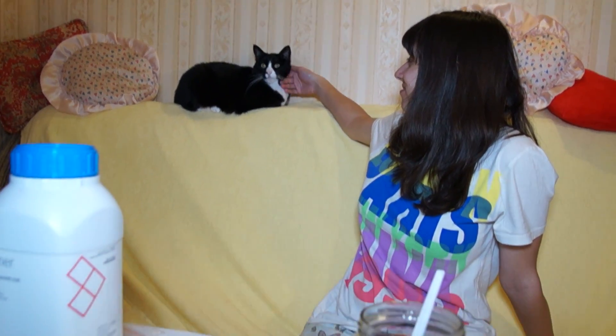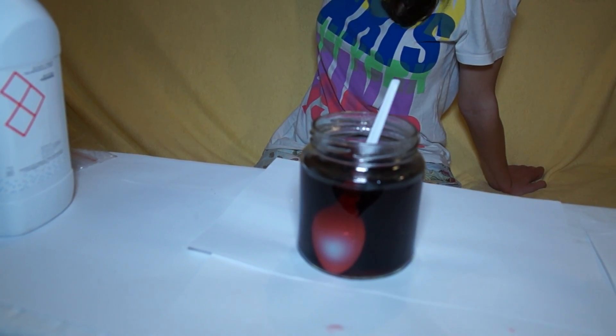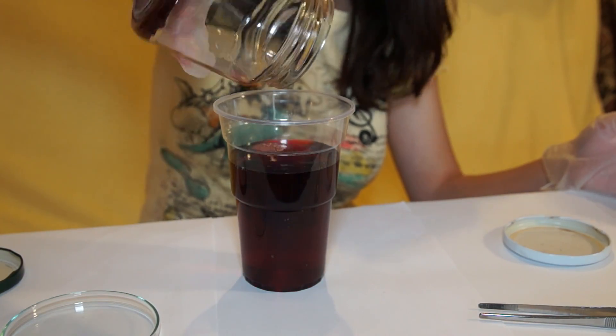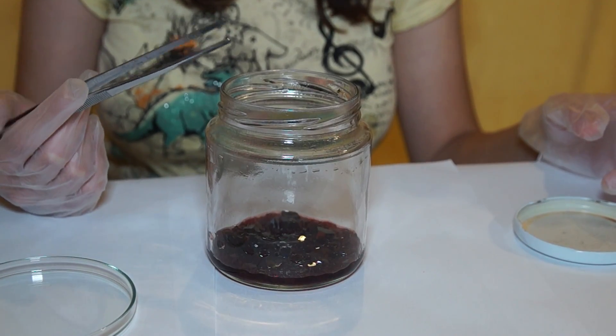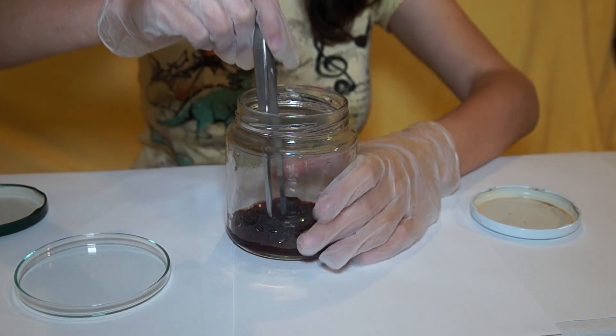During the day, the double salt crystals of cobalt ammonium sulfate are being formed on the bottom of the glass. Crystals of this salt grow better and are more stable in the air. A day later, we can see that many beautiful red crystals have formed.